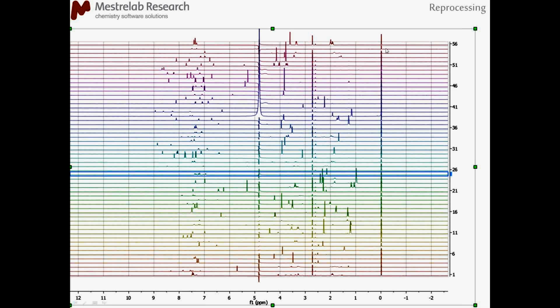And at the end of the day, this is the scenario that we would like to look at. In this particular case, we are looking at close to 60 spectra, all of them mixtures, and we would like to have them as homogeneous as possible. We see that we achieve a high degree of good phase and baseline in each and every one of the samples. This requires a little bit of playing, but we will see later when we jump into the software how to get to this point.